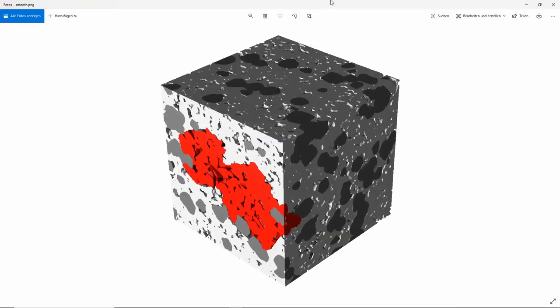This concludes part one of the visualization workshop. We have shown how to visualize volume fields — gray value fields — and segmented microstructures.